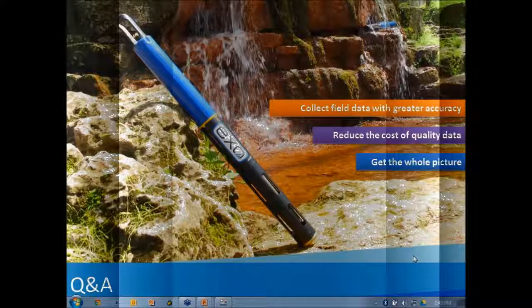Yeah, so here's one that came in saying, hey, I'm currently only using a chlorophyll sensor now. And it sounds like you're better off measuring both. And that's absolutely the point we want to make, is if you're only looking at chlorophyll A sensors, you can miss a very big portion of the total algae biomass. And so the plot I kept showing was a perfect example of that.